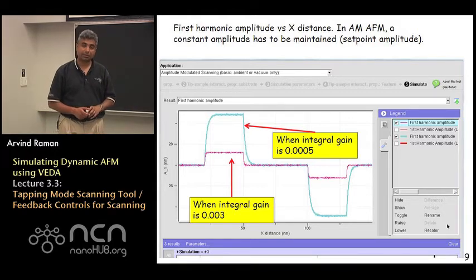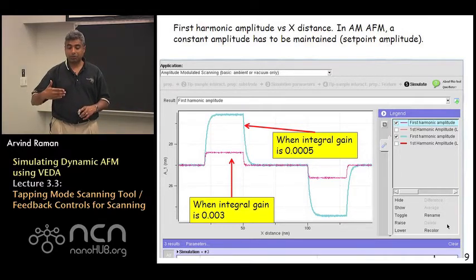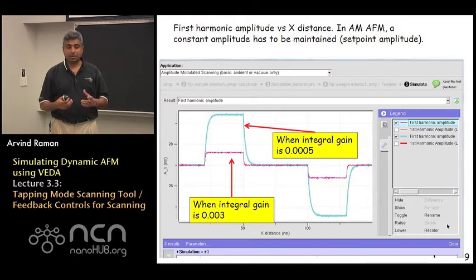If you go to the results in the drop down menu, you can also plot the error signal or the amplitude. Remember that this is the quantity that is being regulated in tapping mode AFM.